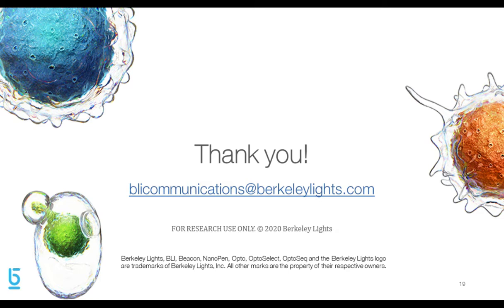Great, thank you. Okay, it looks like your next question is, can all isotypes of immunoglobulins be detected in B cells? Yes, so there is, in principle, no restriction on which isotypes are assayed in this workflow. The selection of secondary detection reagent will determine which isotype is being assayed for.